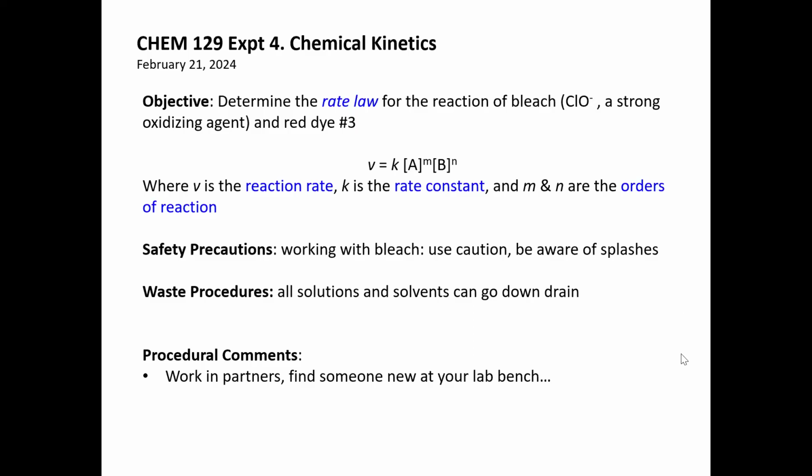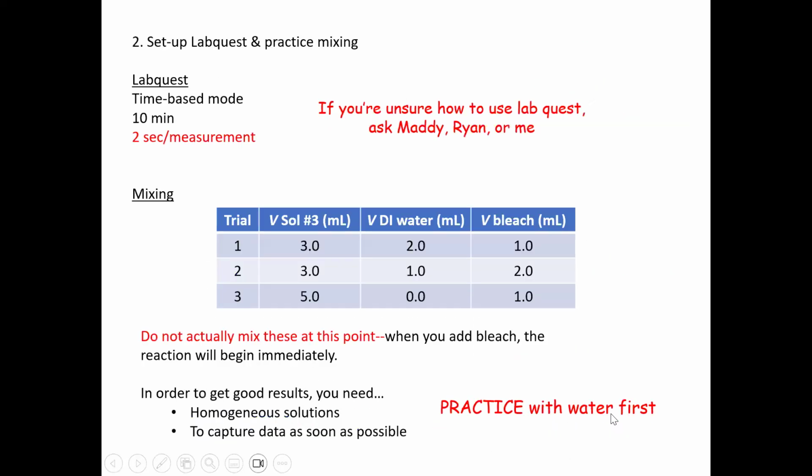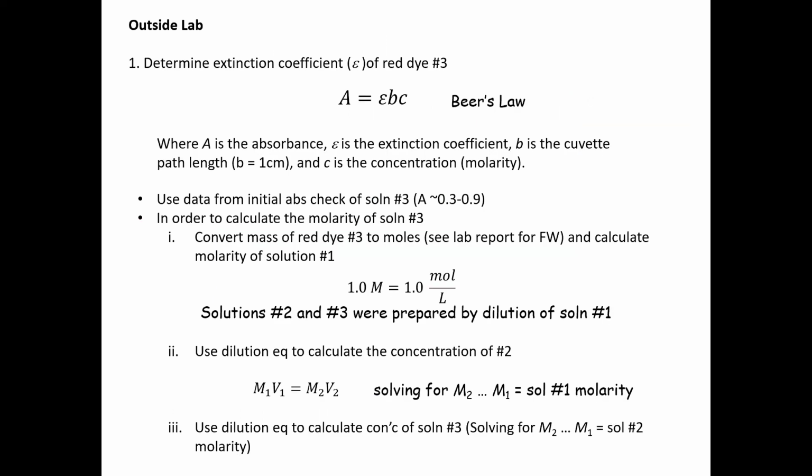This is a video to accompany the kinetics experiment from Chem 129 at Geneseo. As you start out, I would encourage you to review the pre-lab slides, which are up on Brightspace. In particular, I think it has some info about some of the calculations that you'll do outside of lab that are going to be helpful to you.